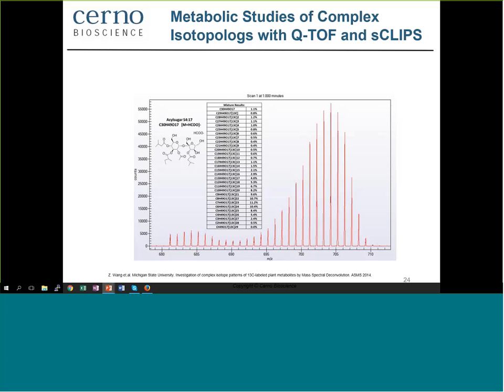Isotope labeling and quantitative LC-MS profiling together in this application offer a really promising approach for unraveling the dynamics of biosynthesis of specialized metabolites, natural products in plants and other organisms. And the isotope patterns and the ratios in metabolites really harbor valuable information which traces the biosynthetic history of specific compounds. So this is of real interest in studying the metabolism of these plants and animals, actually.